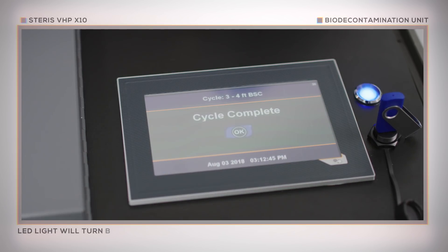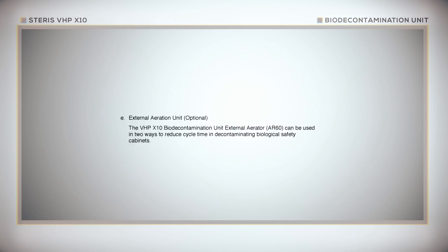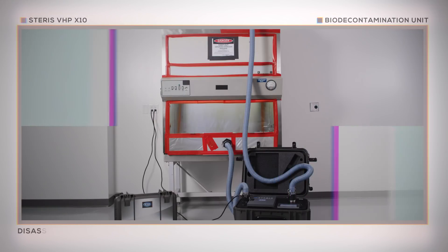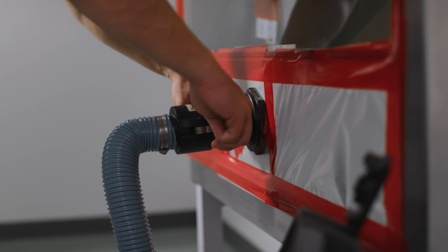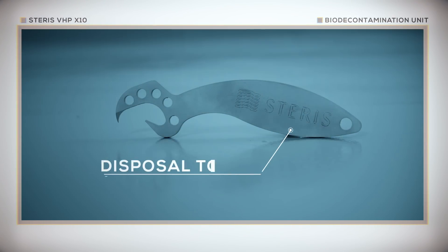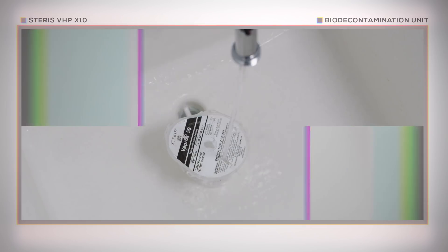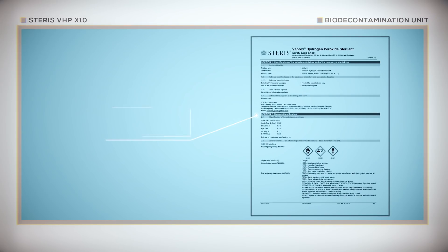Once the cycle has ended after aeration, the operator may begin the teardown process. For use of the operational AR60 external aerator, please review the Steris VHP X10 application guide. Disassembling the VHP X10 unit is an easy and straightforward process. First, disconnect the hoses from the biological safety cabinet and then from the X10 unit. Next, remove the desiccant cartridge from the unit and then remove the Vaprox cup. Use the Vaprox cup disposal tool to properly assist in the disposal of the Vaprox. Users should dilute any remaining peroxide with 20 parts water. Additional disposal details can be found in the Vaprox safety datasheet.